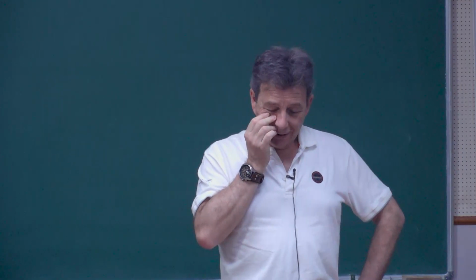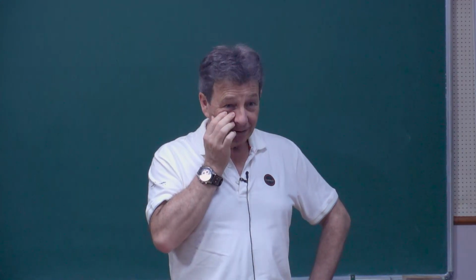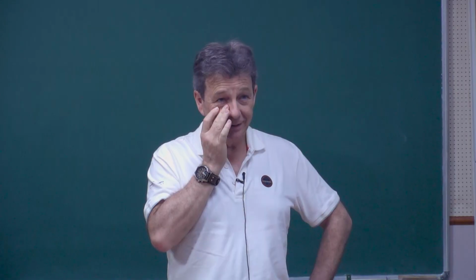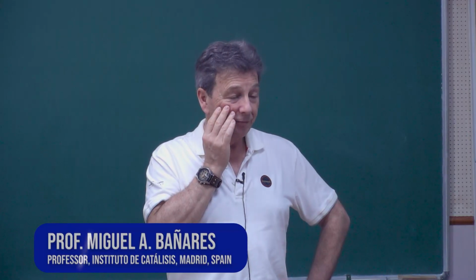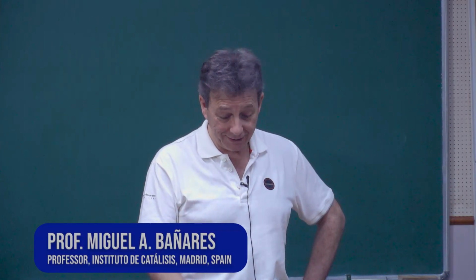Okay, perfect. So today we're going to talk a little bit about the fundamentals of Raman spectroscopy, because out of all the spectroscopic techniques we are dealing with, it is one of the most versatile, and to me is my main first approach technique. And I believe this is important. It also has some details and technicalities that make it special.